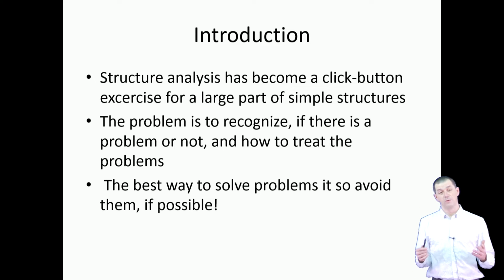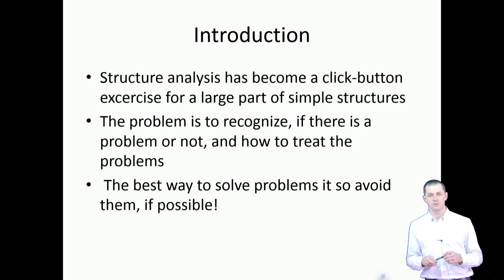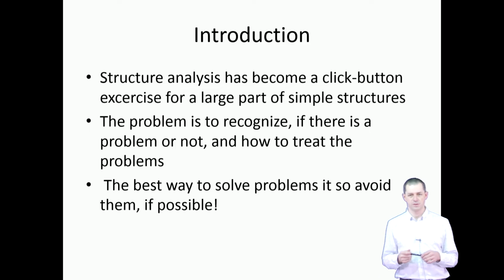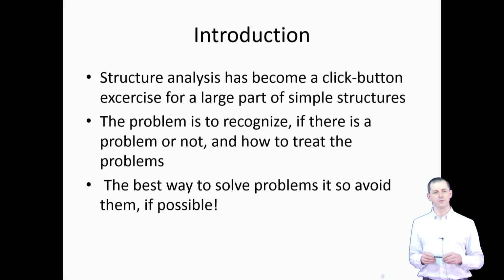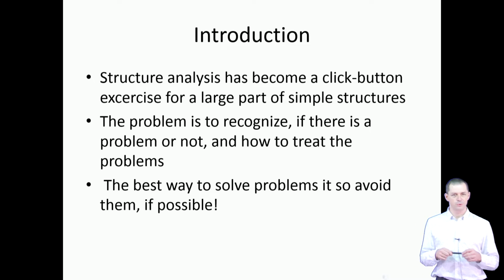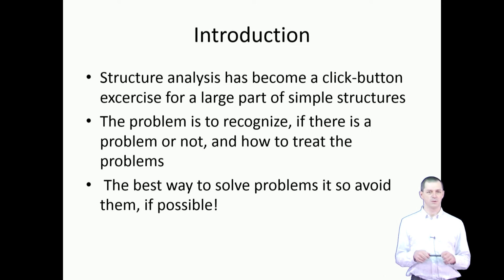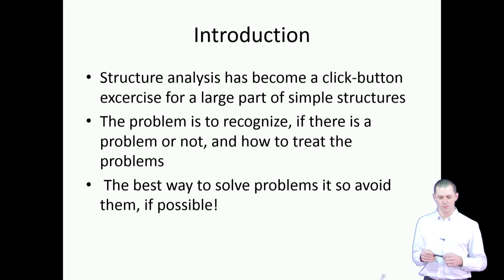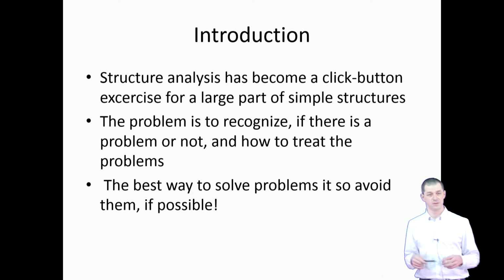The best way to solve problems is to avoid them, of course. That means that you should try to do the best job possible at every stage of the structure determination process. This is especially true for the data collection step. It's really worth spending a day or two or even more on finding a good crystal and collecting good data, rather than spending a couple of weeks trying to improve refinement, which is not so nice just because the data collection or the data quality is not perfect. That's the famous GIGO principle, garbage in, garbage out. If you have poor data set, even the best program in the world will not give you excellent refinement, excellent structure.